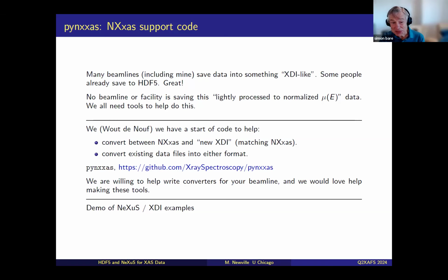Oh, yeah, for sure. Absolutely. We all know the complications there, I think. And then Donato has written in, what about other information such as temperatures, gas flows, voltages? Should they also be included in the metadata?